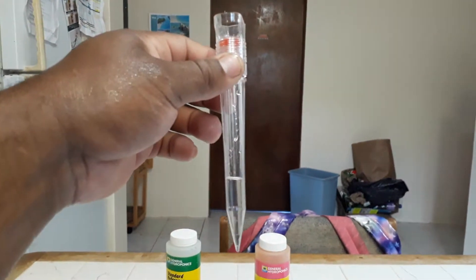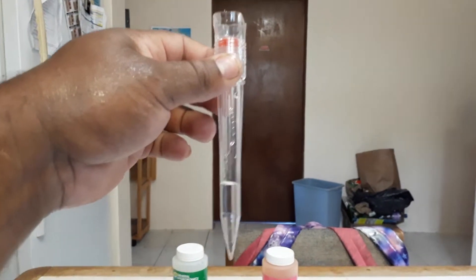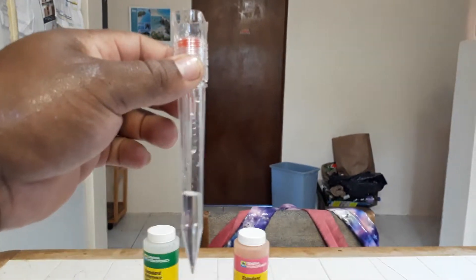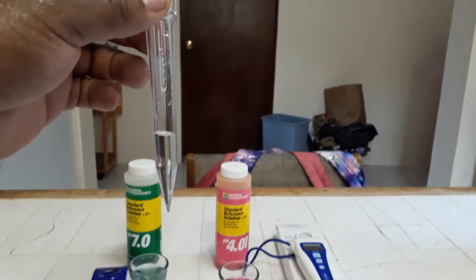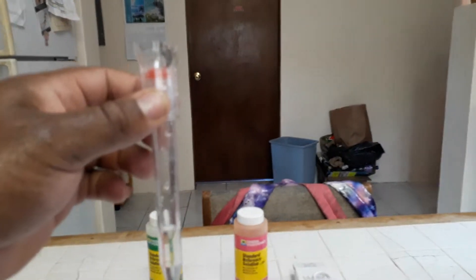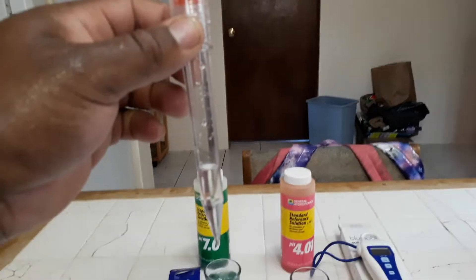When you twist the cap off, it comes with solution already inside — just enough to keep the tip of the probe wet or moist. I'm going to find somewhere to put this so I don't lose that solution, and then we're going to calibrate.